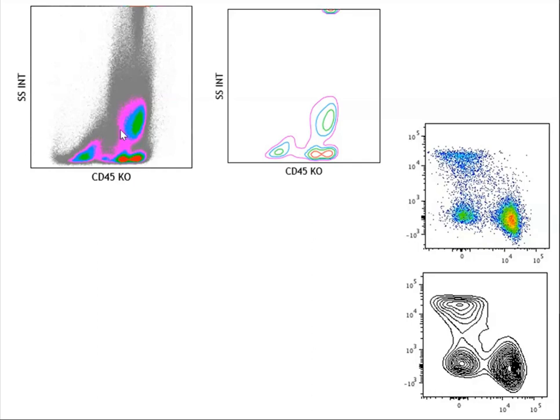If you see this particular granulocyte or neutrophil cluster, it doesn't have any area with red color, because it is not as concentrated as lymphocytes in this region. The concentration is not that dense, so you have green. It's just showing where the population is much concentrated. If it is red, highly concentrated. Then green, moderately concentrated. Something like that. Okay, thank you.